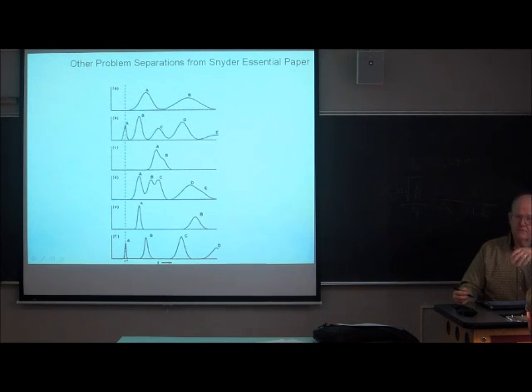I'm not going to go over them. I think it's more than a good idea that you be familiar with different chromatographic issues and suggested ways around them. And I just want to say that temperature programming and gradient elution is not the answer to every single problem that exists in chromatography.